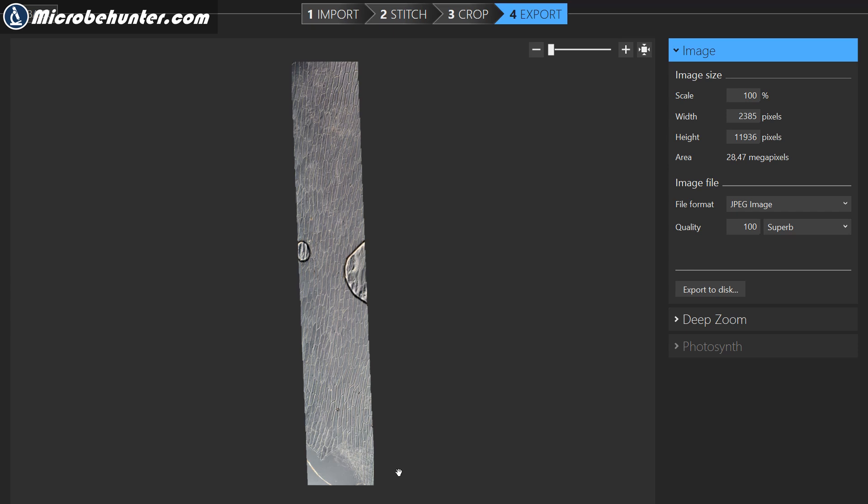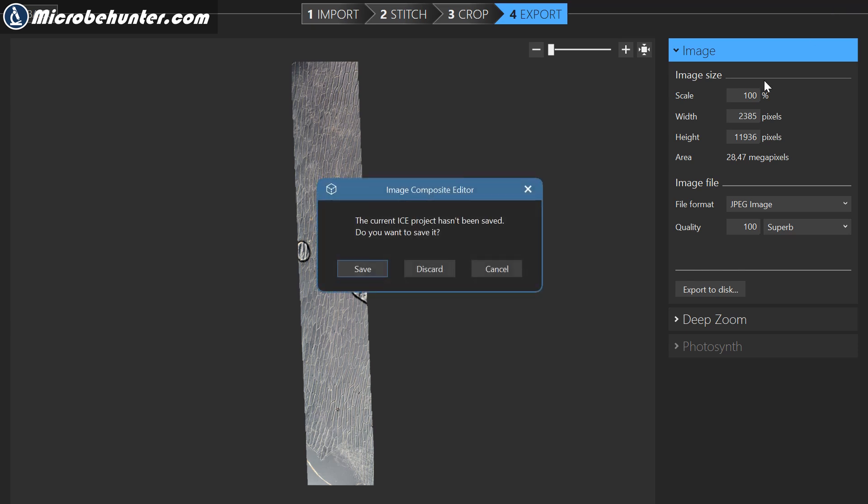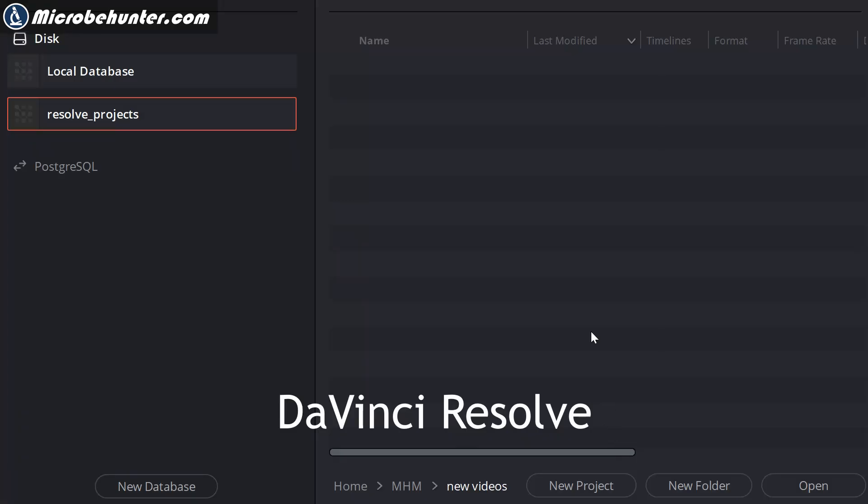Now the good thing about MS ICE is that it is also optimized for planar images. So it's not about simply making panorama images when you're rotating the camera from a fixed point, but it's also by horizontal movement.